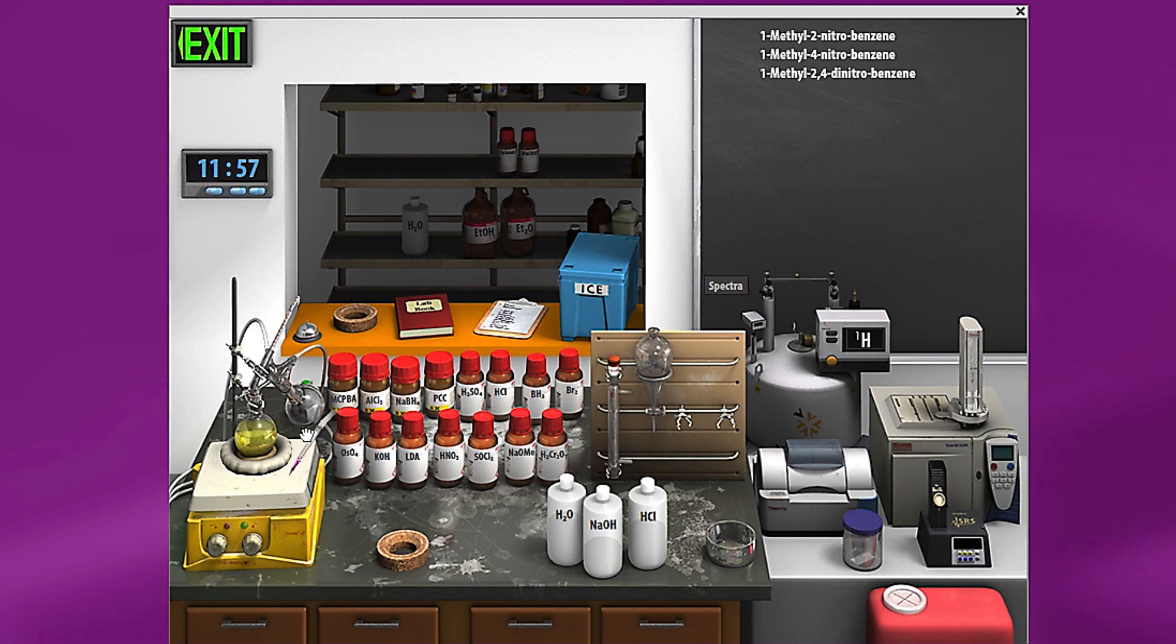I'm going to attach nitrogen and begin stirring and heating. I'll advance the time just a minute or two. Come back here to check the temperature. You can see it's 123 and a half degrees Celsius. We still haven't seen anything here in our collection flask.